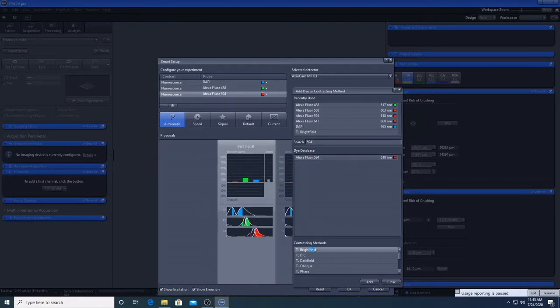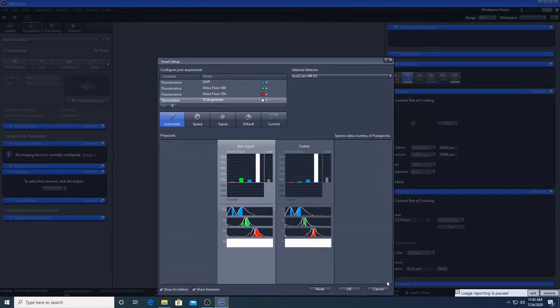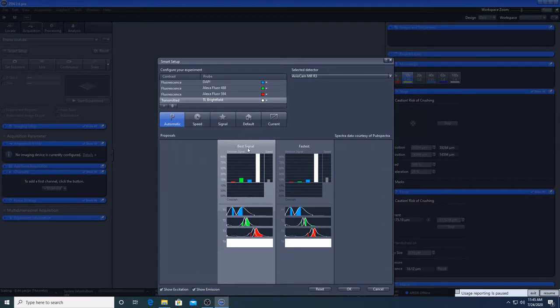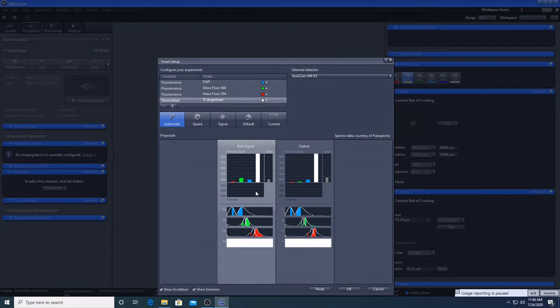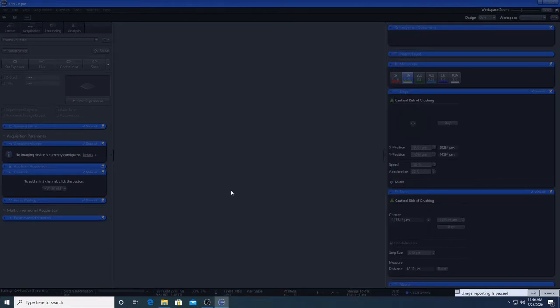I will also add a bright field channel. Including a bright field channel when you are doing fluorescent imaging can be helpful for indicating details otherwise not apparent, such as blebbing. Using our fluorophore information, the software will automatically choose the filter cube and light sources required. It doesn't make any difference if you pick fastest or best signal here, because this microscope is a wide field system, so press OK.